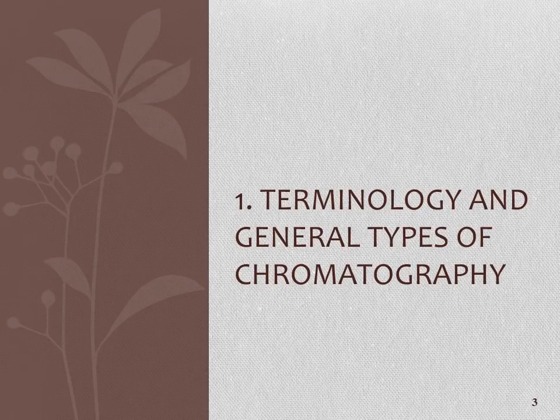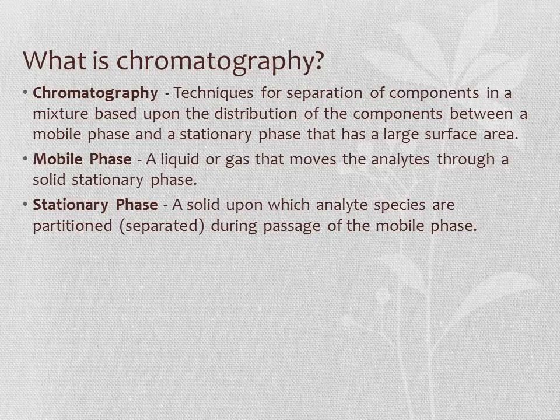So what is chromatography? Let's start with some terminology and a discussion of what the general types of chromatography are. Chromatography is simply a fancy word for separation of molecules. We have a mixture of components, usually chemicals, biological species, medicines, metabolites of medicines, and we want to separate them. We do this by passing them over a stationary phase, which is usually a solid or liquid, and we have the molecules carried by a mobile phase, which is usually a liquid or gas. It is the distribution of the components in between these two phases that causes our separation.